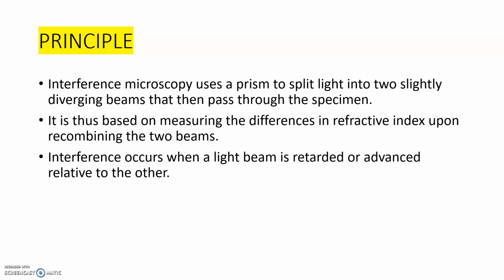This diverged beam of light then falls on the specimen.